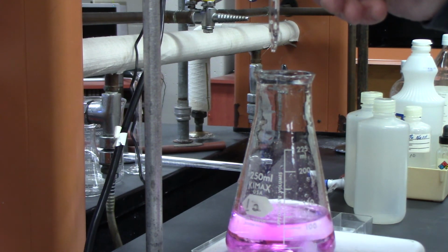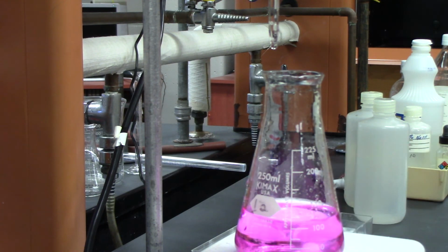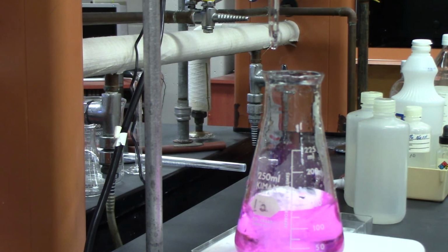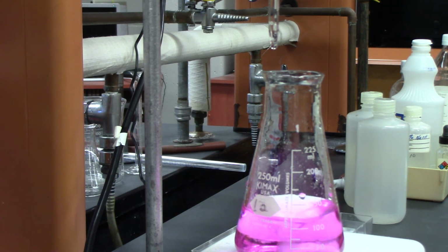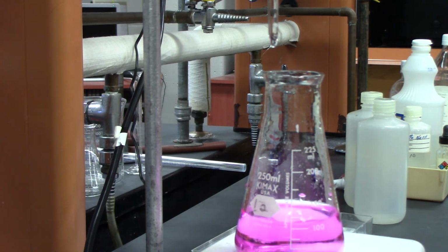Okay, it's almost there. Turn it off. Okay, you can see that it turned pink. I'm gonna stir it up really good, make sure it stays pink. And record the value now, it's good, 30.65. Okay, so there's our final result.